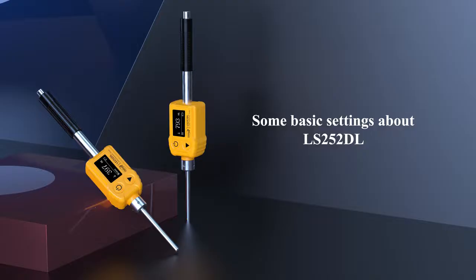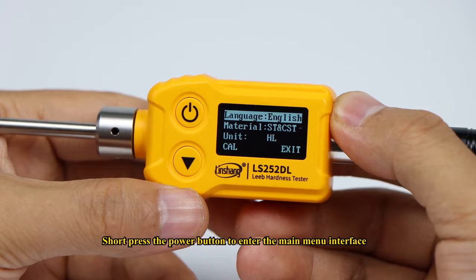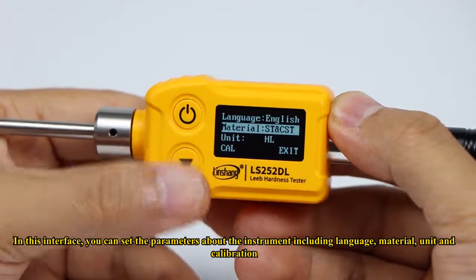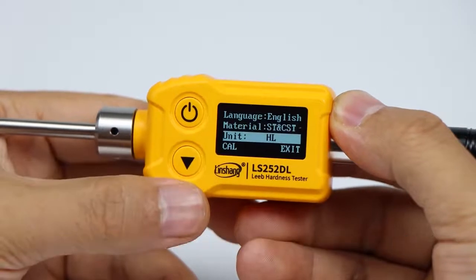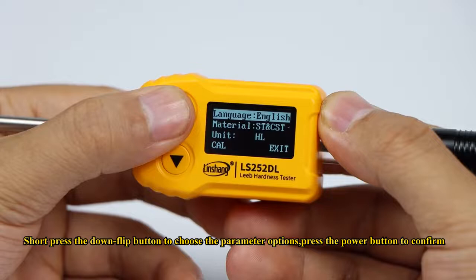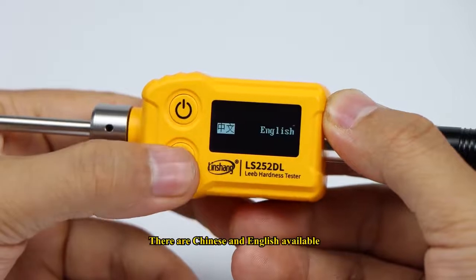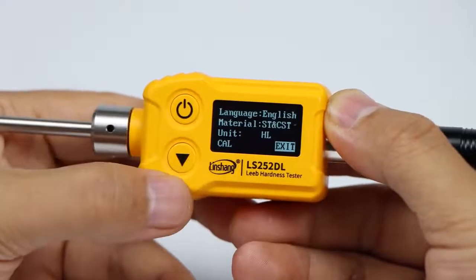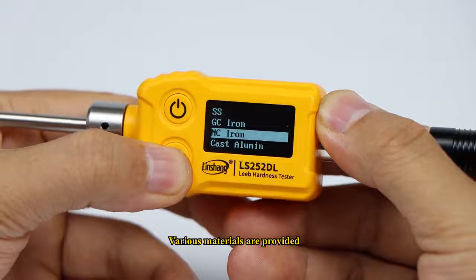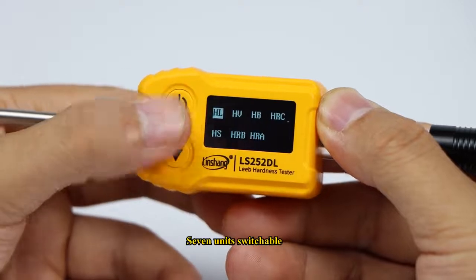Some basic settings about the LS252 DL: Short press the power button to enter the main menu interface. In this interface, you can set parameters including language, material, unit, and calibration. Short press the down flip button to choose the parameter options, then press the power button to confirm. There are Chinese and English language options available, various materials are provided, and seven units are switchable.